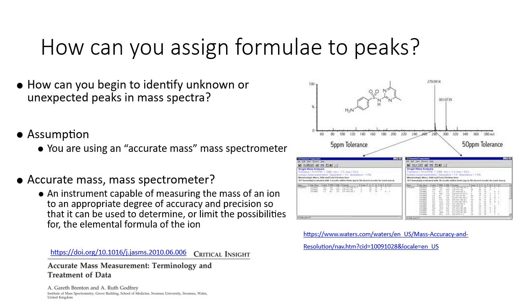So you'd normally want to be using an instrument which would be specified with at least 5 ppm mass accuracy in order to be able to attempt this process. It will work on instruments with lower mass accuracies, but with less assurance of success unless you're only working on very small molecules or you can already cut down some of the possibilities of the assignments using information you know about that sample.